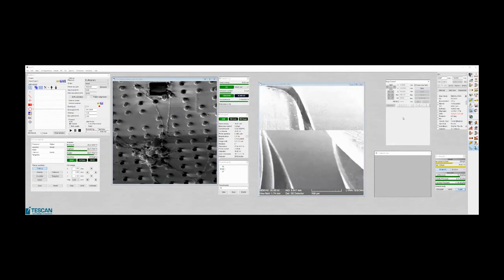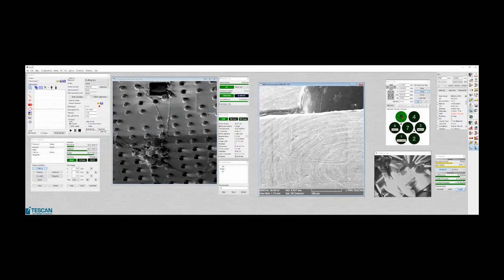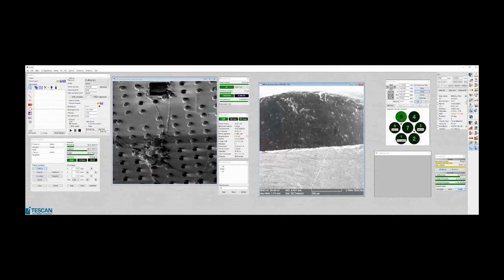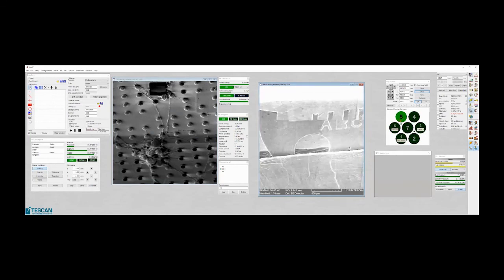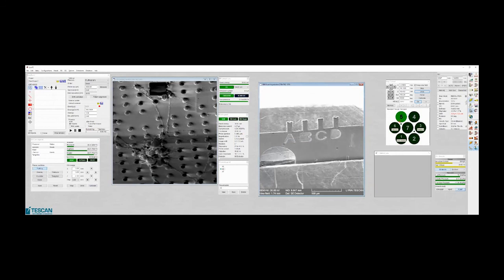I don't know which one I have. Is that one? Yep. You will fix it on your sample holder. So here is the sample holder for transmission electron microscope. For each of these fingers, you can place one lamella from the side, and then you turn it off and you can put another one from another side. So you can place 8 samples in a row to the TEM.